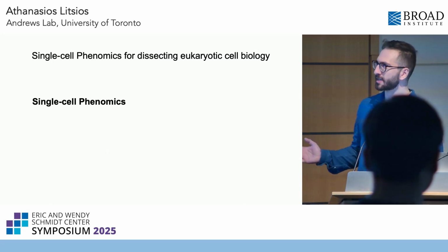Today I'm going to tell you a few things about how we use single snapshot images of live cells to study dynamic cellular phenomena at scale. So in the lab we use single-cell phenomics.